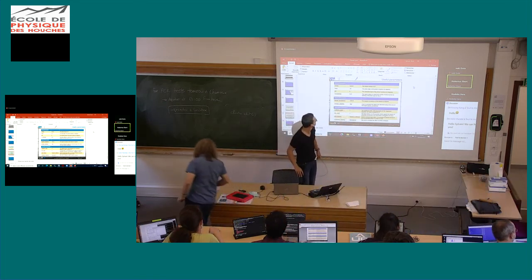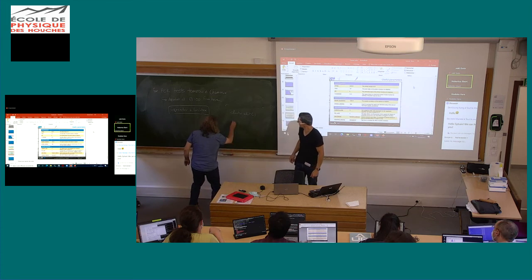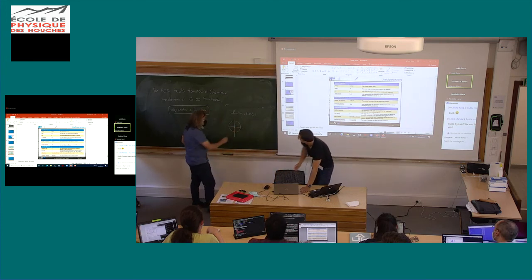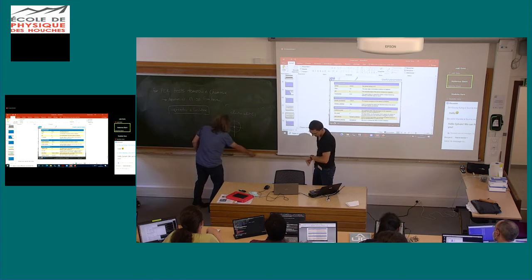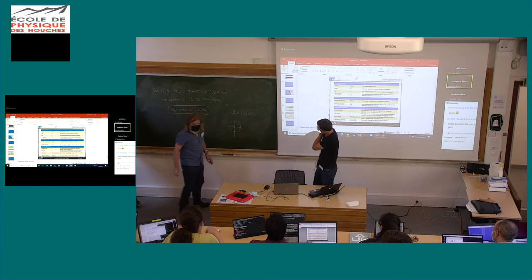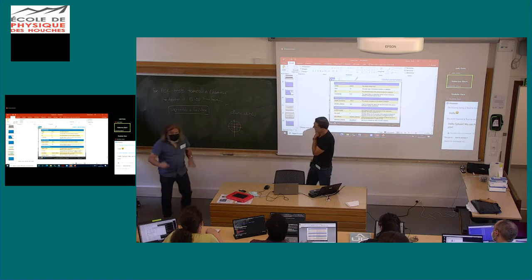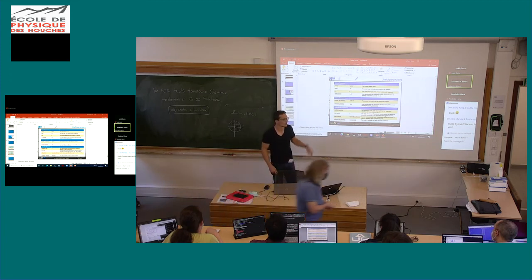So we assume that your analyzer has a circular acceptance. Here is the direction of your electron. This is the acceptance of your analyzer. If you set it too low, you sum over these points, these directions. If you set the next one, you divide everything by 2, and you include all the new points which are inside the circle. So you have none, low, medium, and high.